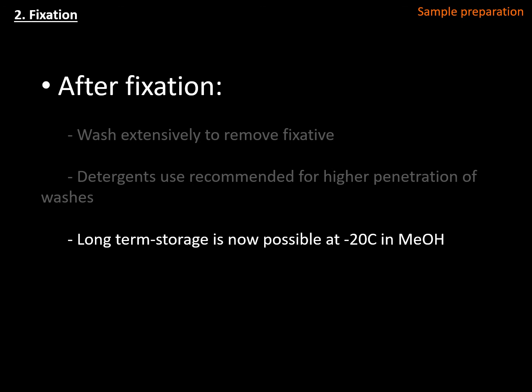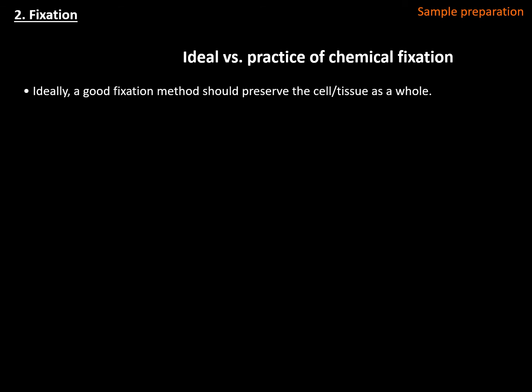First, it allows the removal of some lipids from the cell membranes, promoting better access of chemicals later on. And because it doesn't freeze at -20, it allows you to keep your samples in very stable conditions that you can use later on when the time is more appropriate. However, fixation is this combination of ideal versus practice.